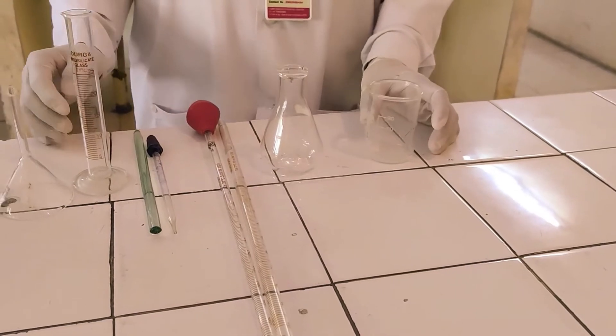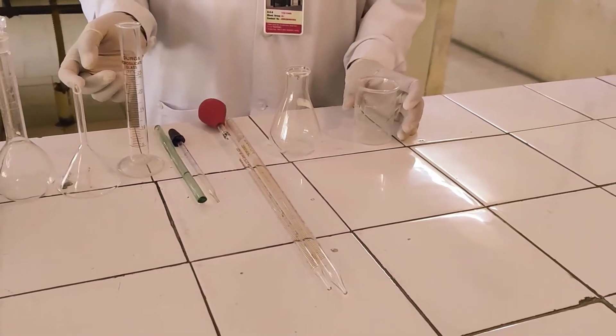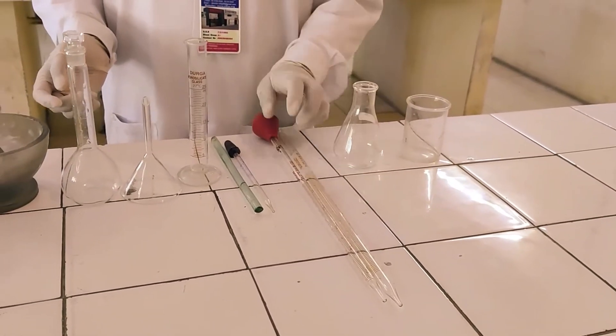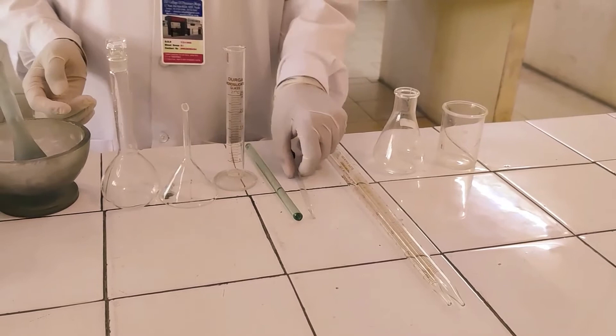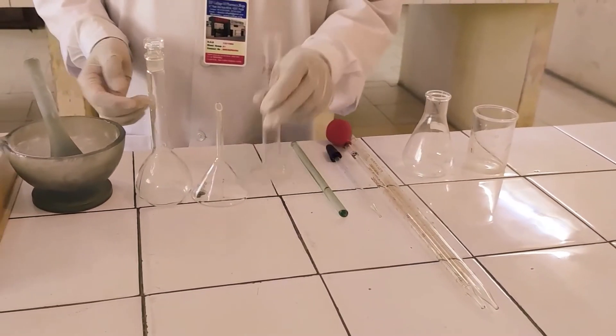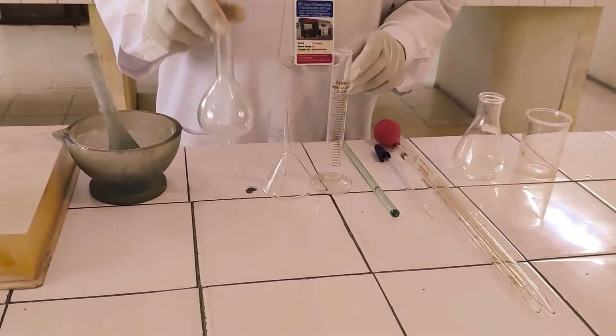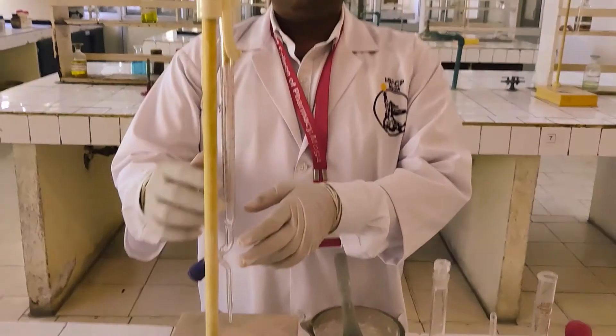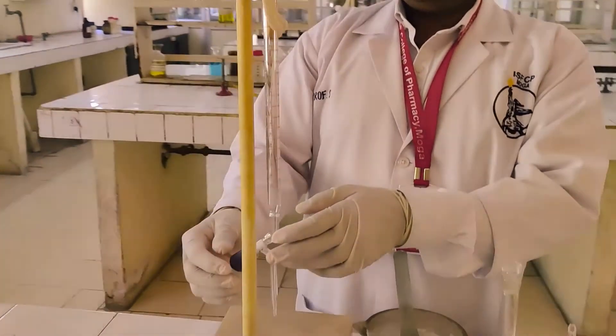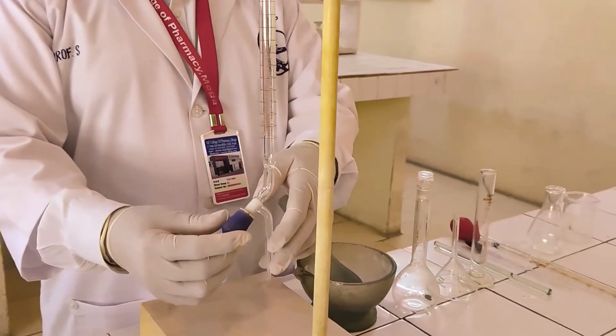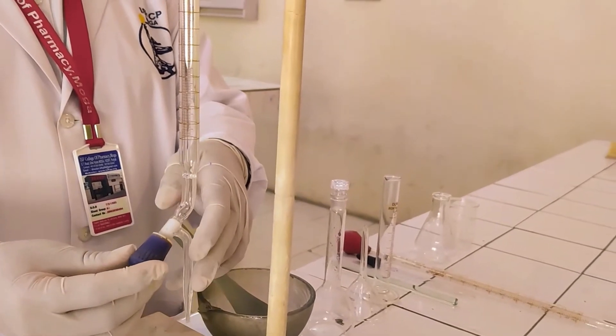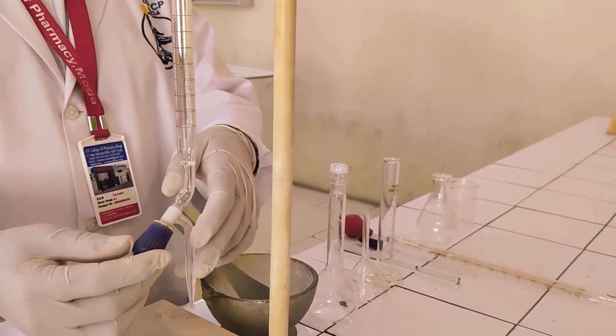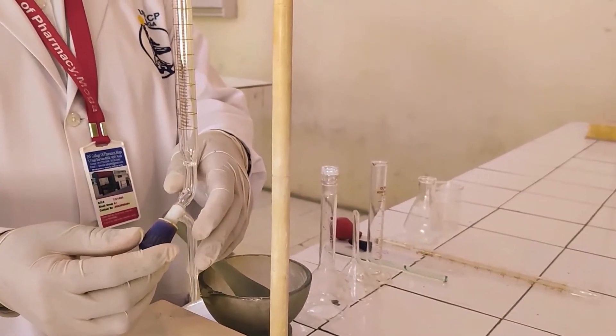For the assay of aspirin you will need following glasswares: beaker, conical flask, pipette, dropper, glass rod, measuring cylinder, funnel, volumetric flask, mortar pestle and burette and burette stand. You can see this knob, this knob is made up of PTFE, polytetrafluoroethylene. Why polytetrafluoroethylene? Because it need not to lubricate.